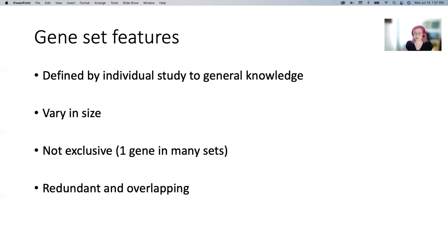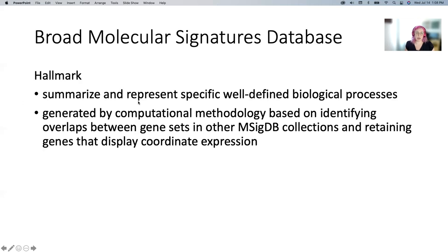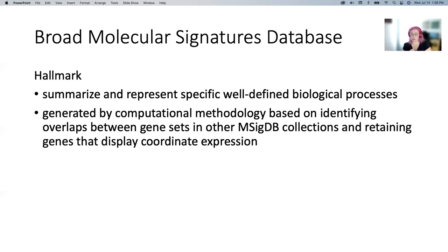You can get gene sets from lots of different places. The one we're going to use is from Broad — it's their Molecular Signatures Database. I'm going to highlight the ones we're going to use in the workshop, but there are other ones there and in other databases.